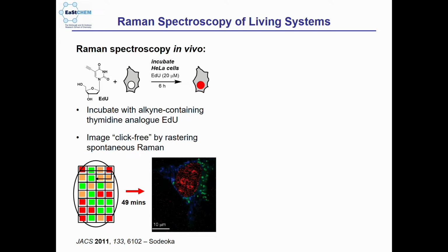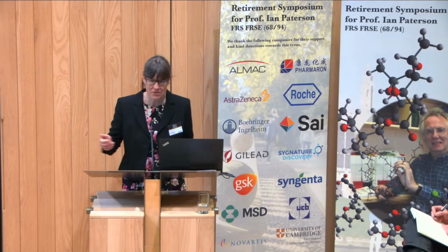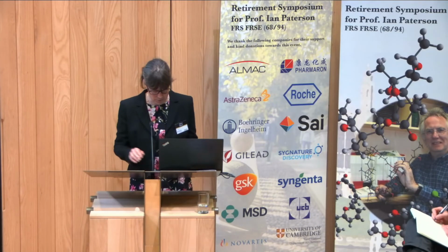And I'm going to lead you through some of the chemistry behind this. So I thought this was really, hey, I don't have to do that click chemistry. This looks good. I can stick a propargyl group on something, and then I can just image it directly. Not quite that simple. And you'll also see that this took 49 minutes, which is not the best.